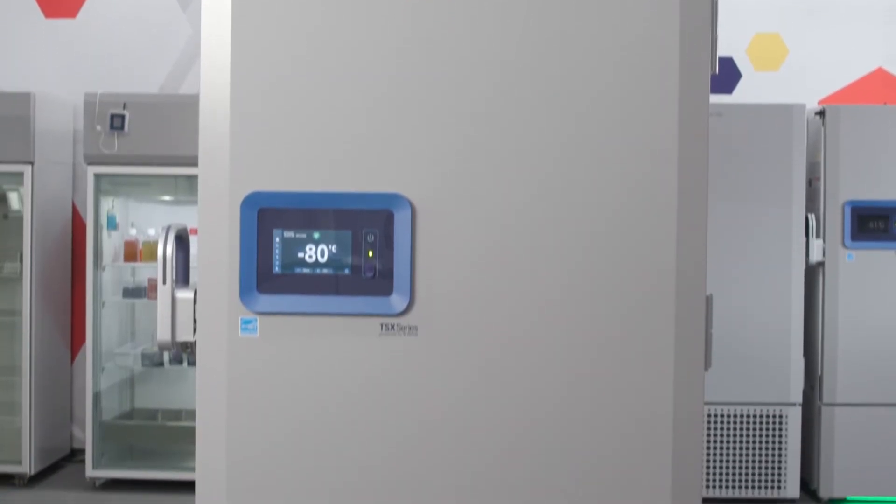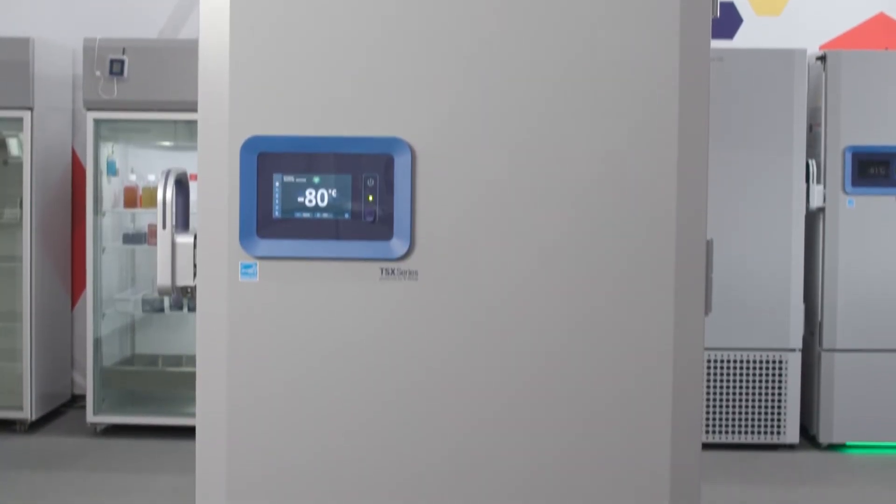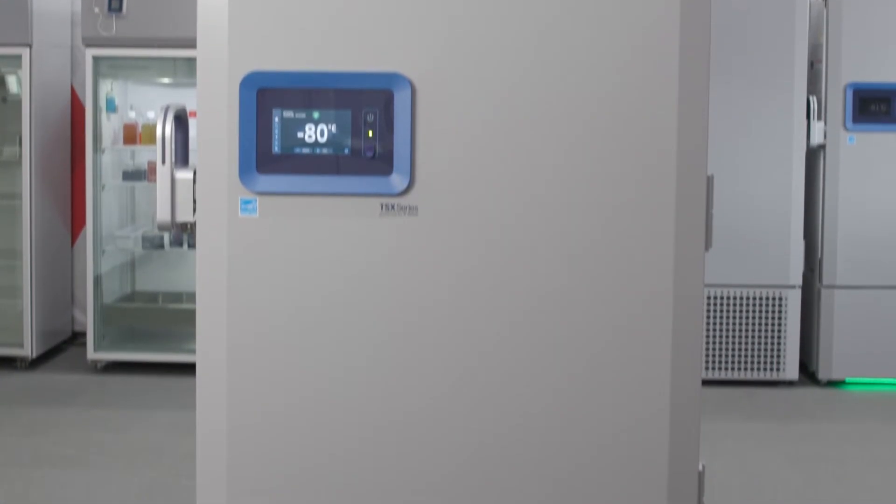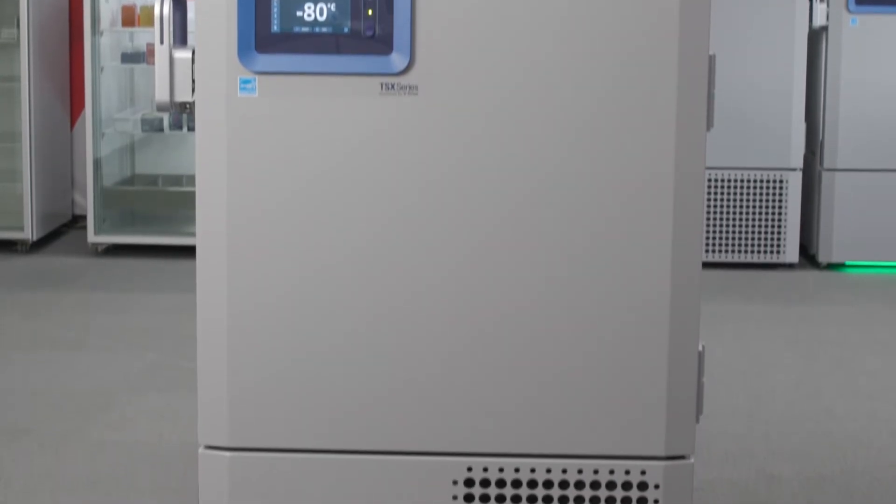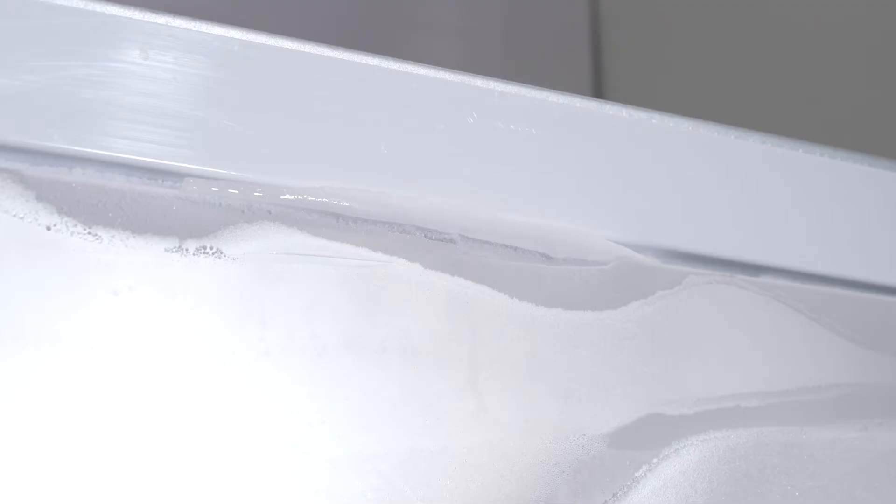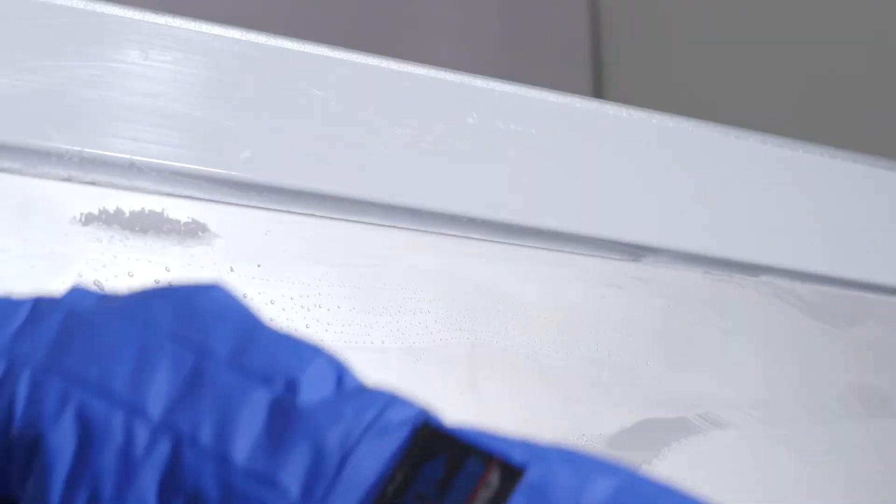Hello and welcome to this video about maintaining your ThermoScientific TSX Universal Series ULT Freezer. Today we'll look at some important tips for keeping your freezer operating at its best.